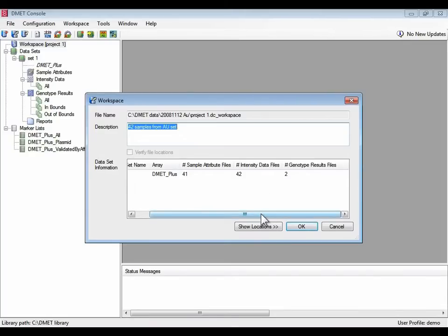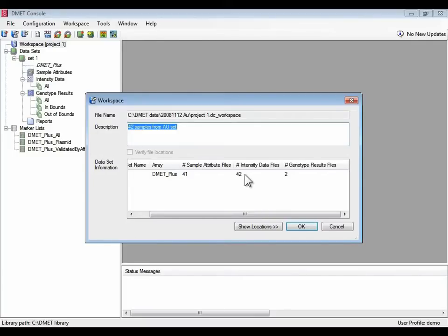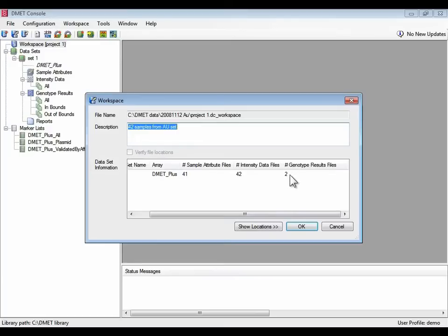Each data set can store up to one genotype result file for every one intensity data file. So with 42 intensity data files, we should be able to get up to 42 genotype results files, one for each sample. So more data in this data set needs to be genotyped.